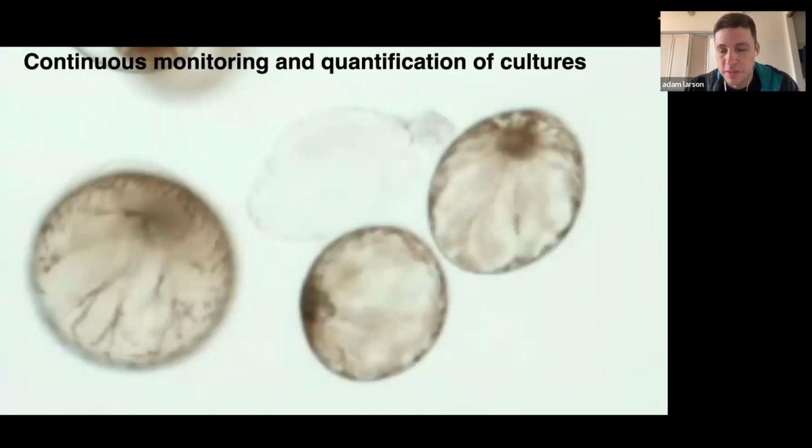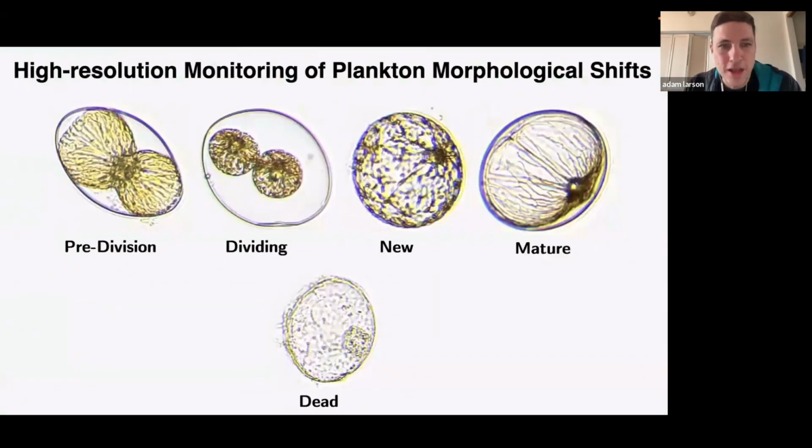And so with the PlanktonScope, I was able to take tens of thousands of images and make these different classes. So I was able to take these segmented images and then see that this one species of plankton actually looks very different over the course of a few days as it goes through its division cycle. And if you're kind of naive, you would say, my goodness, these aren't the same plankton species, but in fact they are. So with these tens of thousands of images and a lot of these other really beautiful open source resources we have, at this point you can make extremely good object classifiers with even just a few hundred objects, and then go back to your plankton images.